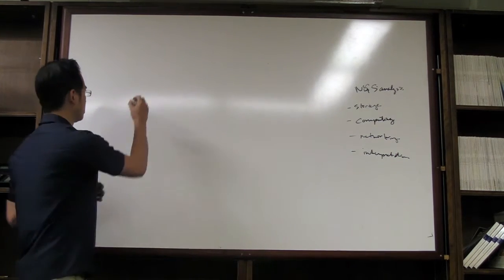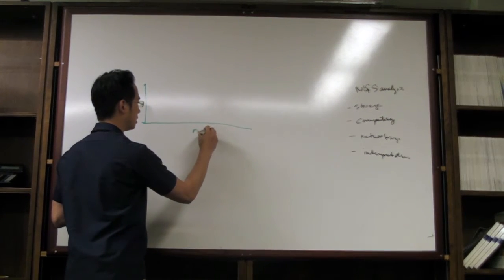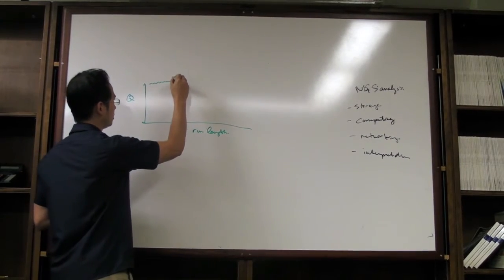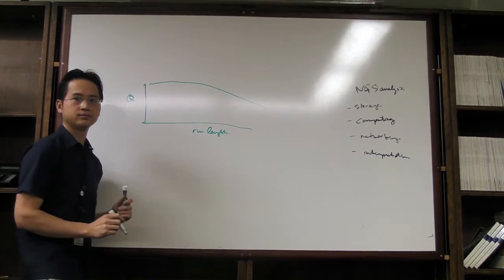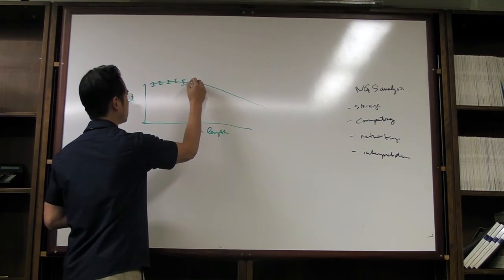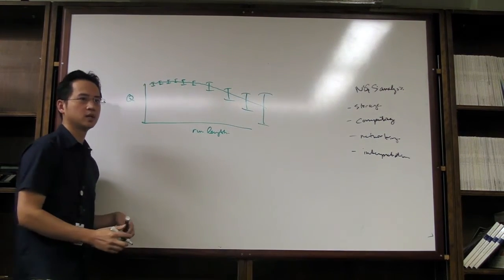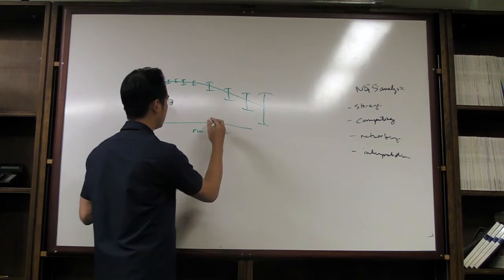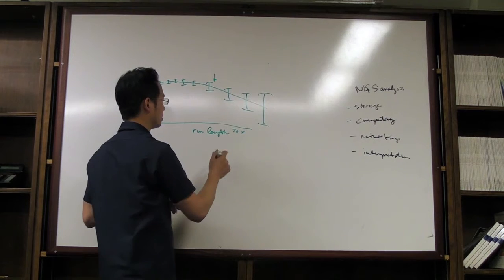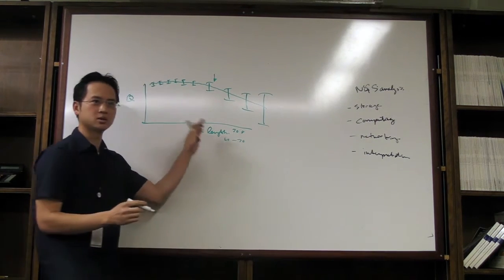And then all of these sequencers, if you were to plot the quality versus the run or the length of the sequence, it'll start off high, but they all dwindle like that. And if you were to do some standard deviation, it'll be something like that. So Illumina, I would say around base 70, 80 is when the drop is. Ion Torrent, maybe around 60, 70. Maybe with the new chemistries it's a little bit better.